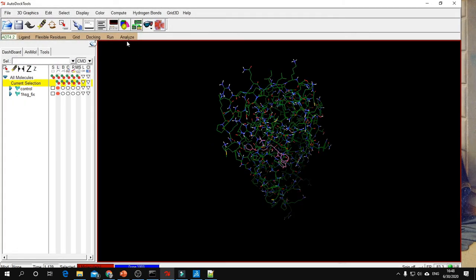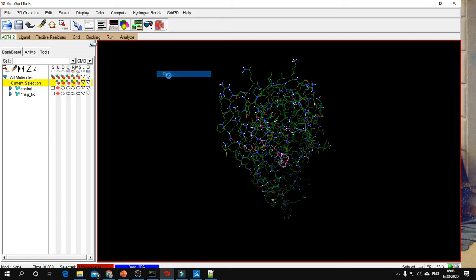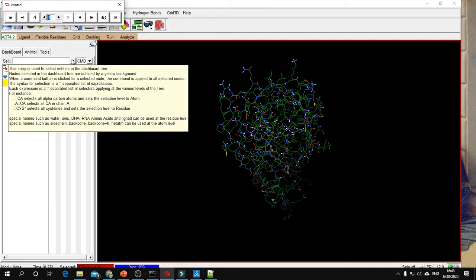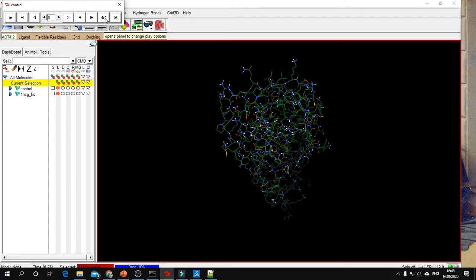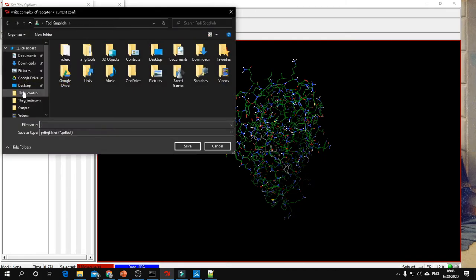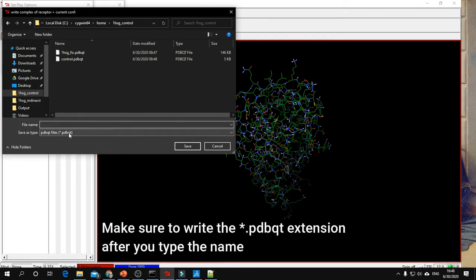Go to Analyze, Conformations, Play. Here you can enter the conformation number. Our best conformation is number 8, so write 8, press enter, and click Write Complex. Go to the same folder and save the complex as a PDBQT file. I will save it as run_8.